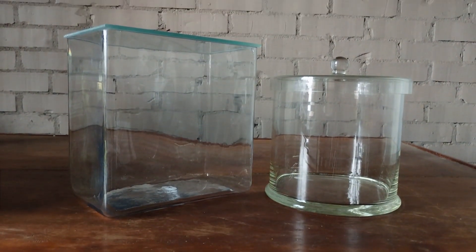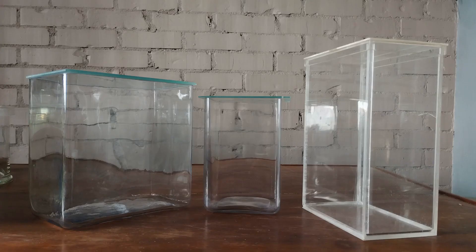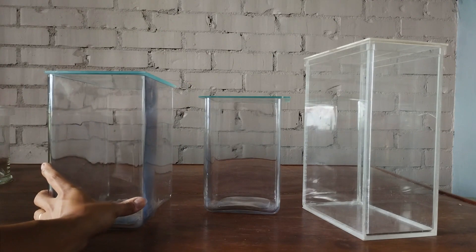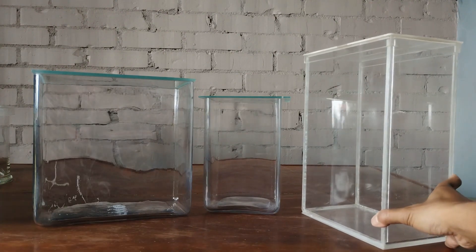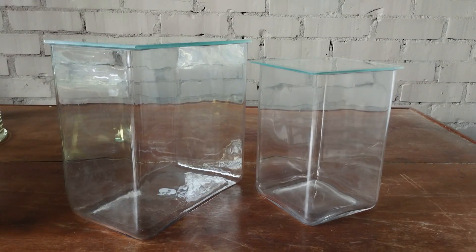Museum jars are specially designed for long-term storage of valuable wet specimens. Rectangular museum jars, like the ones shown here, are the most commonly used for specimen storage. High-quality rectangular jars are usually made from chemically and thermally stable borosilicate glass, although more inferior quality glass made from soda glass and plexiglass or acrylic sheets are also widely used. Rectangular jars come in a handful of standard sizes — the bigger jar is 25 cm length by 14 cm width by 25 cm height, while the smaller one is 14 cm by 14 cm by 22 cm. Slightly taller or wider variants are also available.